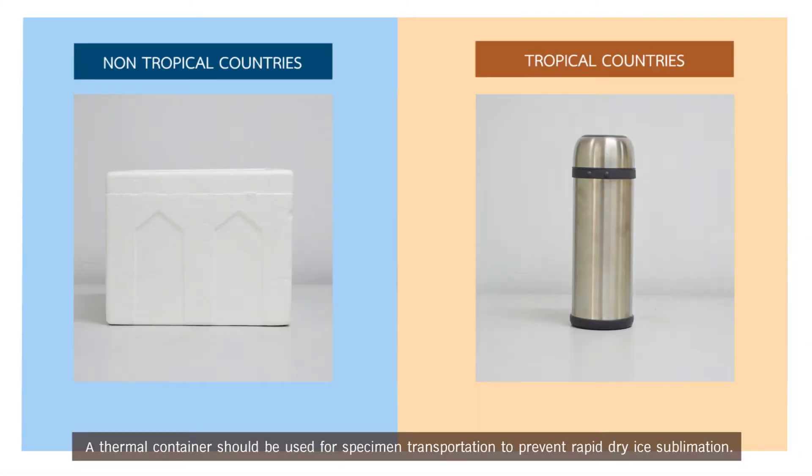A thermal container should be used for specimen transportation to prevent rapid dry ice sublimation. In non-tropical countries, if the sample can arrive within a few days, a polystyrene foam box packed with dry ice may be used. In tropical countries, we recommend using a 1.5 to 2 liter vacuum flask.